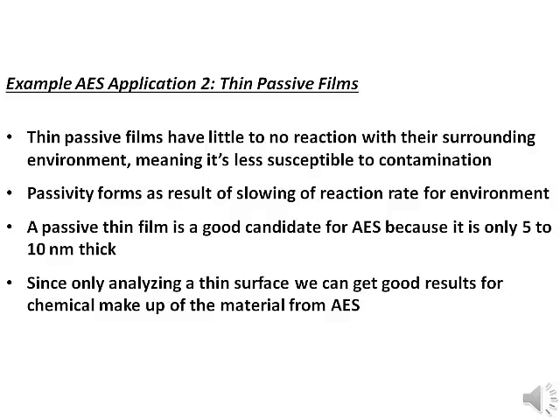Another application for AES is thin passive films. Thin passive films have little to no reaction with their surrounding environment. The passivity forms as a result of the slowing of the reaction rate. A thin passive film is a good candidate for AES since we're only dealing with the outermost atomic layer. Since we're only analyzing a thin surface, we can get good results for chemical makeup.